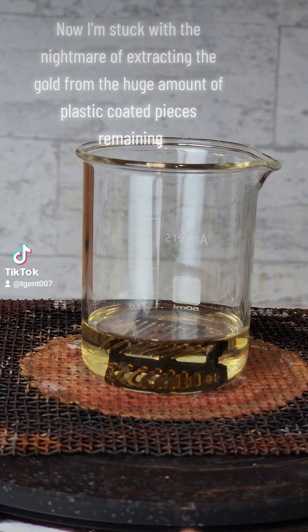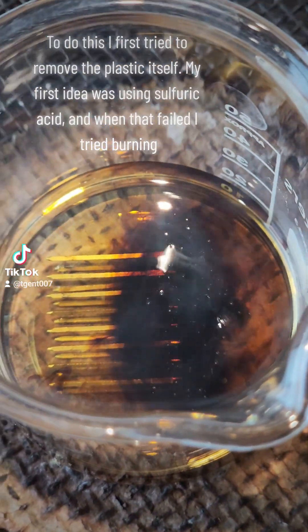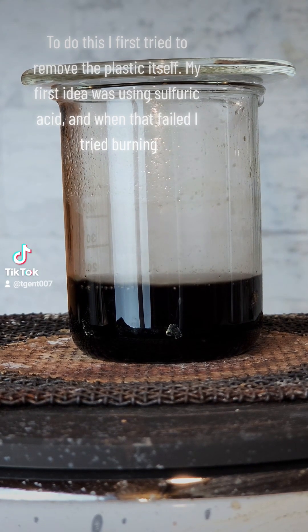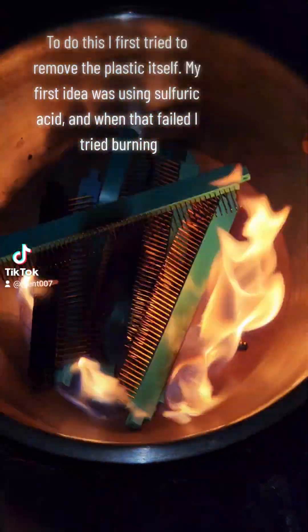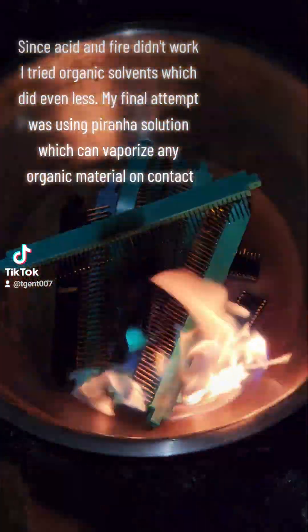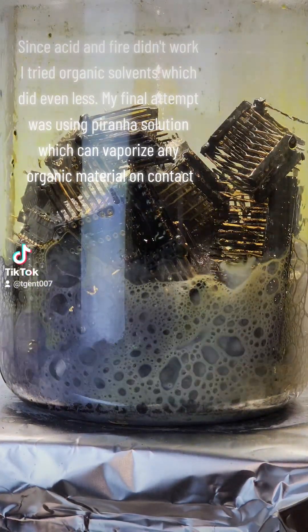Now I'm stuck with the nightmare of extracting the gold from the huge amount of plastic coated pieces remaining. To do this, I first tried to remove the plastic itself. My first idea was using sulfuric acid, and when that failed, I tried burning. Since acid and fire didn't work, I tried organic solvents, which did even less.